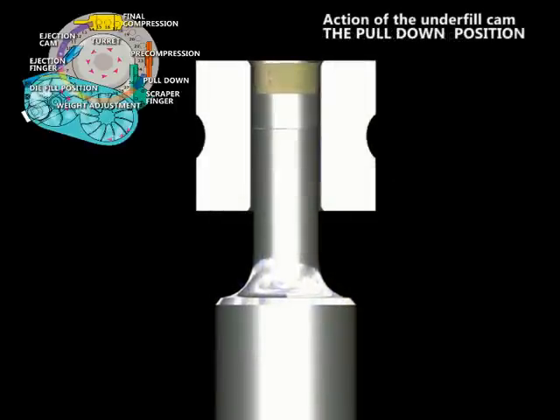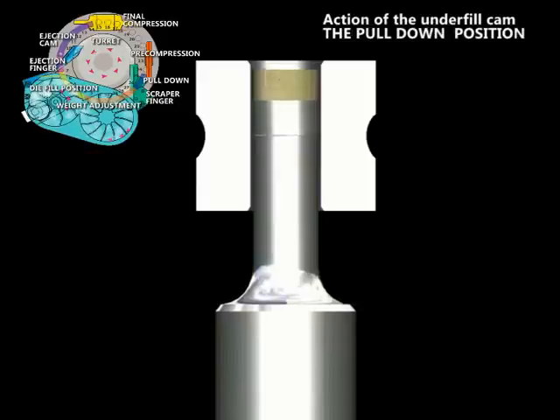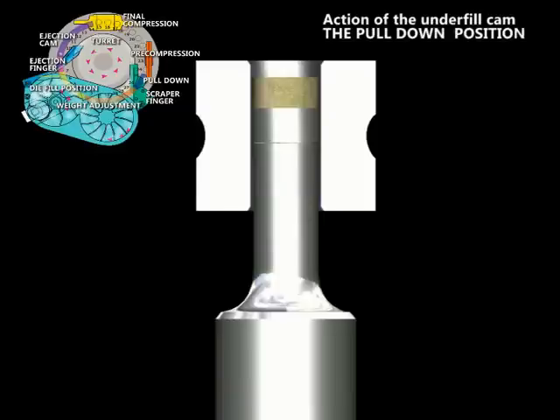The pull down position allows the lower punch to be pulled down slightly so that the top of the powder column in the die bore is below the surface of the die table. Simultaneously, the upper punch is lowered.